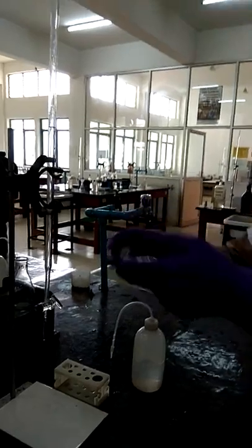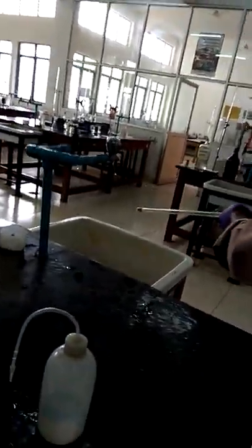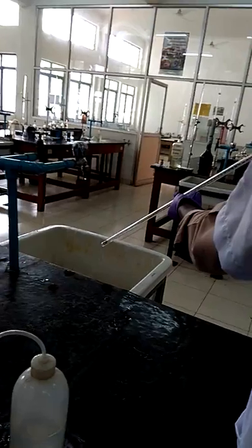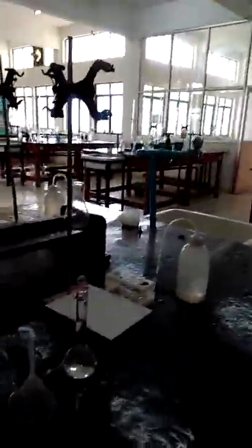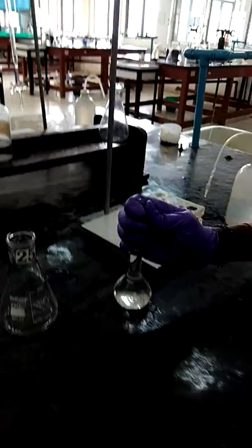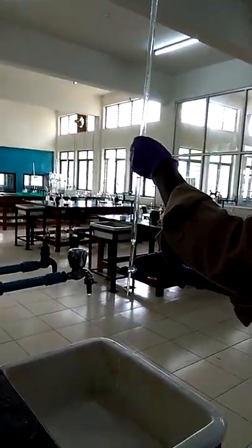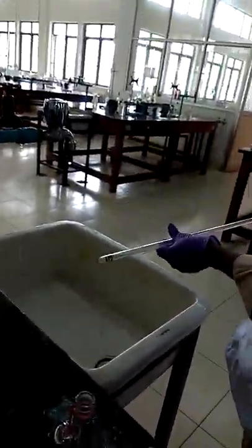Then take the solution and rinse the burette and then fill the burette. Throw away the distilled water which is present in the burette. Rinse the burette with the prepared EDTA solution. Place the funnel, hold it in the left hand, and go near the sink. Take a little solution, about 5 to 10 ml, just to rinse the burette. Rinse the tip and then rinse the burette.